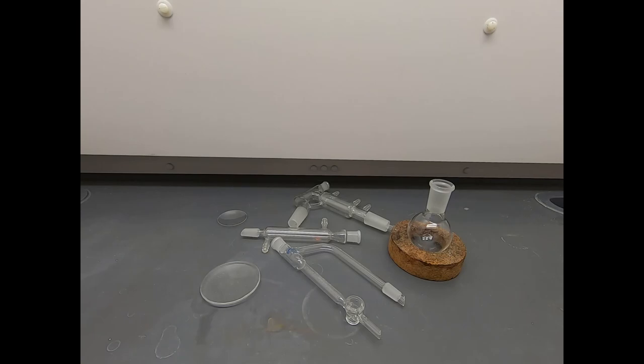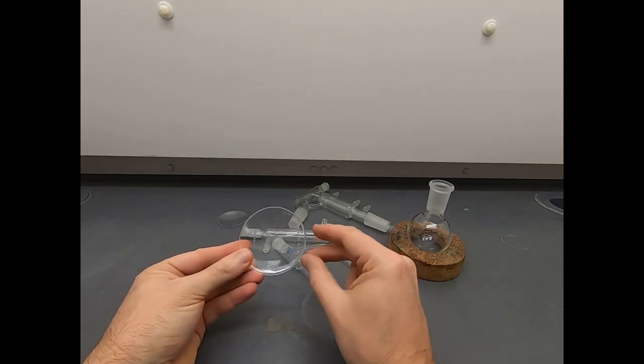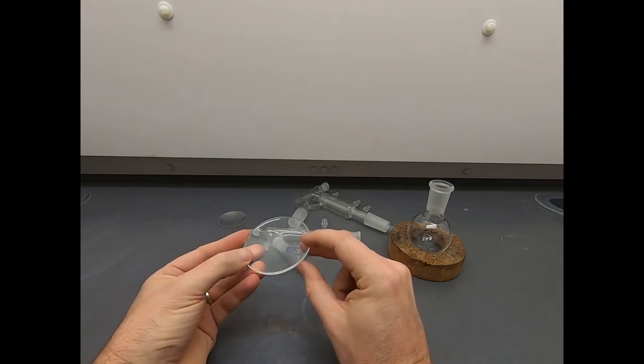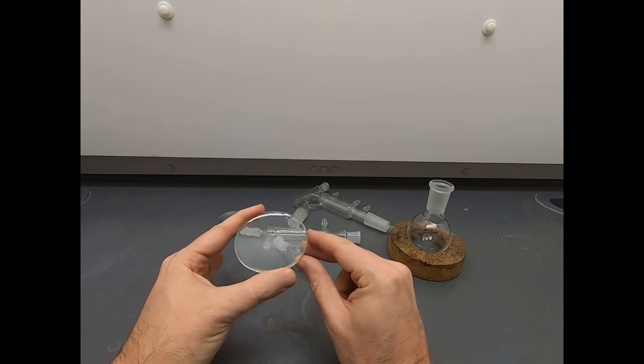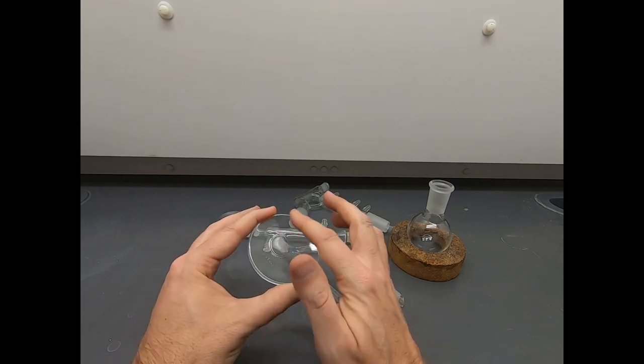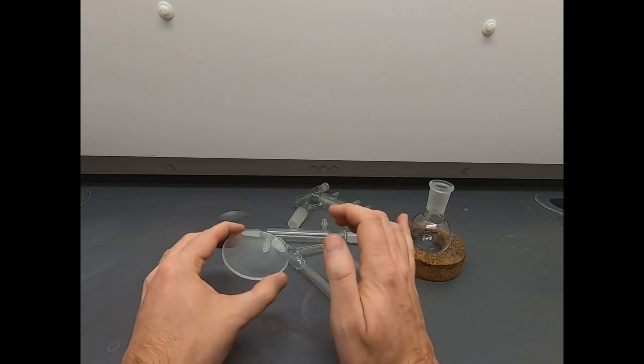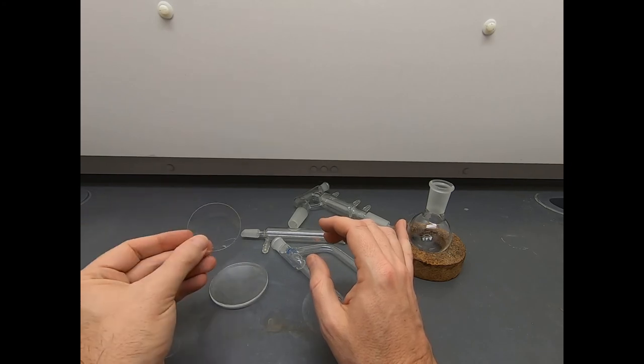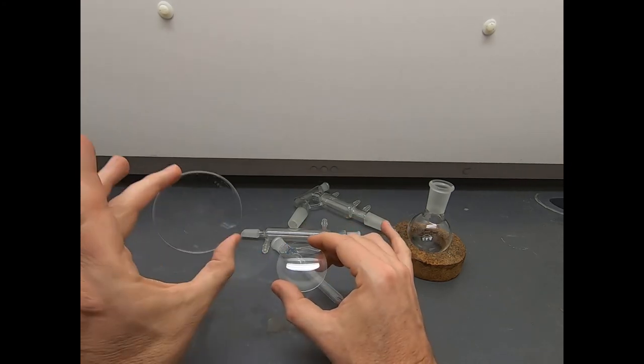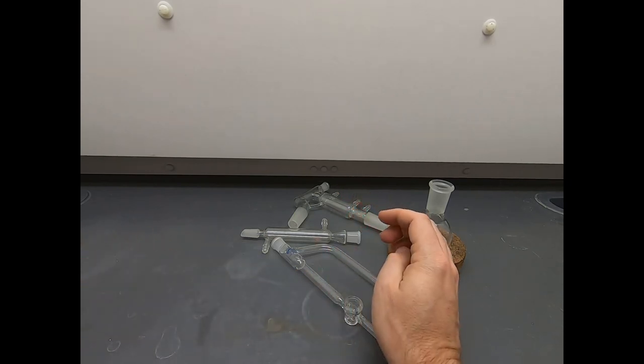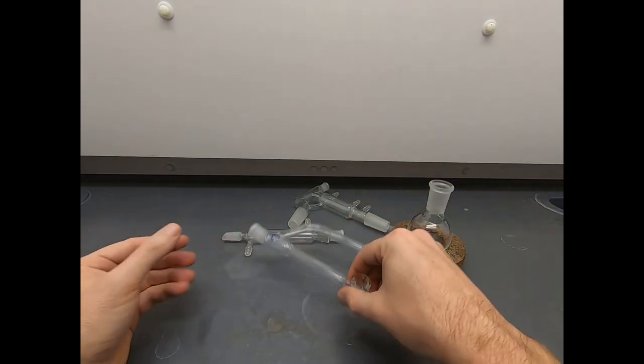To wrap up this video, we're going to see a mishmash of different types of glassware. I'm going to start on the left with watch glasses. Almost everybody encounters watch glasses in the laboratory. These are fantastic. If you've collected a solid and you wanted to let it air dry, spreading out the solid on a watch glass is a great method for that, to leave it for a couple days and make sure it dries in the air. Of course, there are smaller watch glasses and bigger watch glasses, but those are just representative examples.